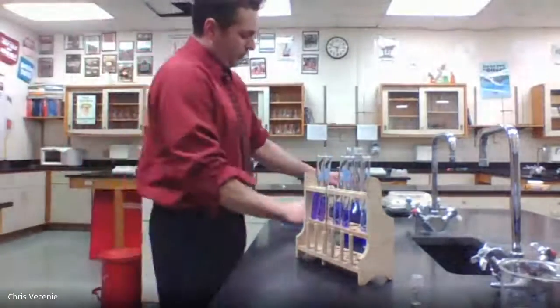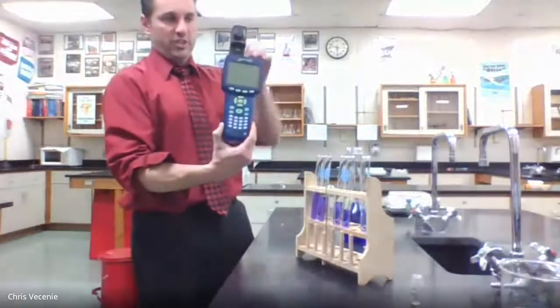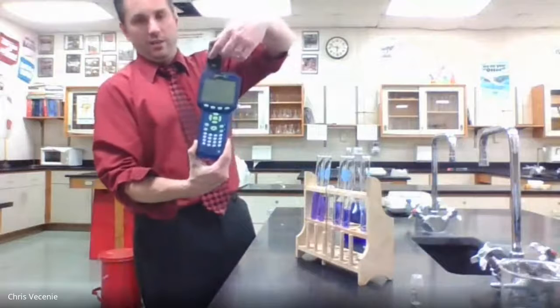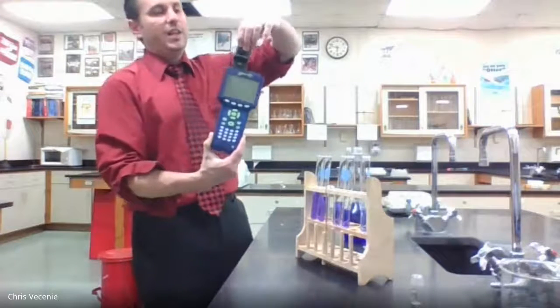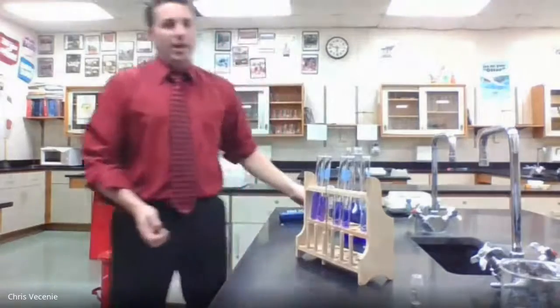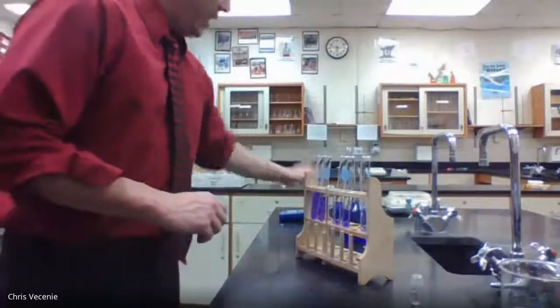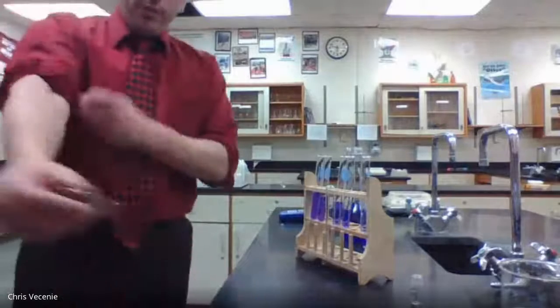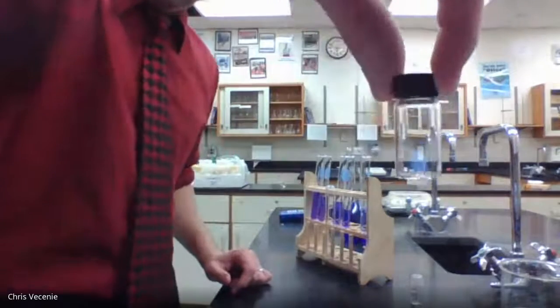All right, then what we'll do is we would use our colorimeter, which is this guy right here. It's got an open space, and I'm going to put a cuvette in here. And the cuvette is going to be filled with our various solutions, and then the probe is going to measure what the absorbency is. So here's your cuvette right here.